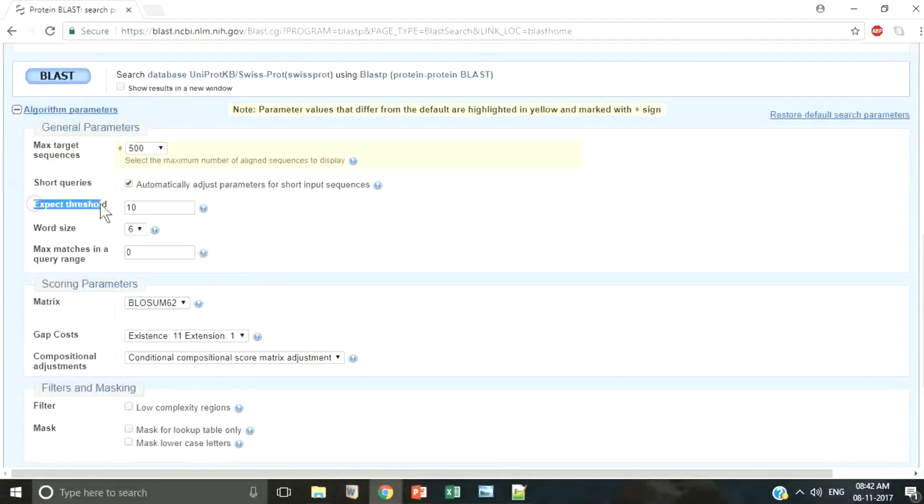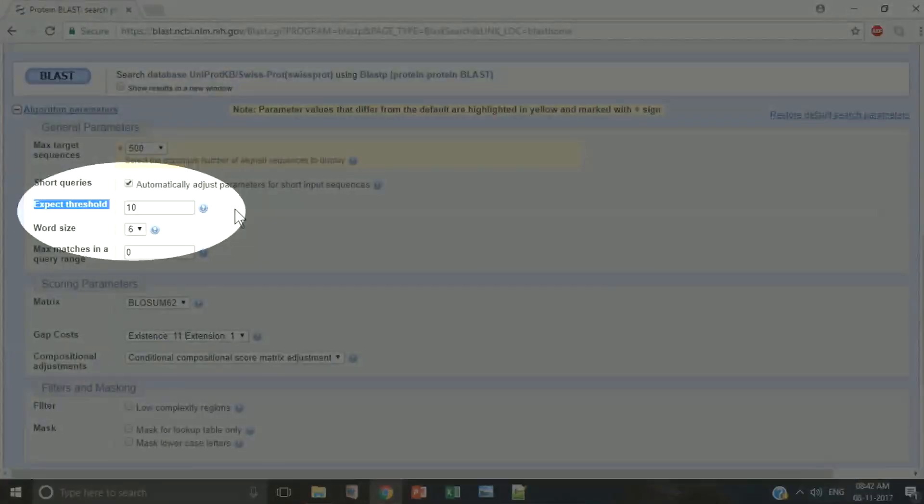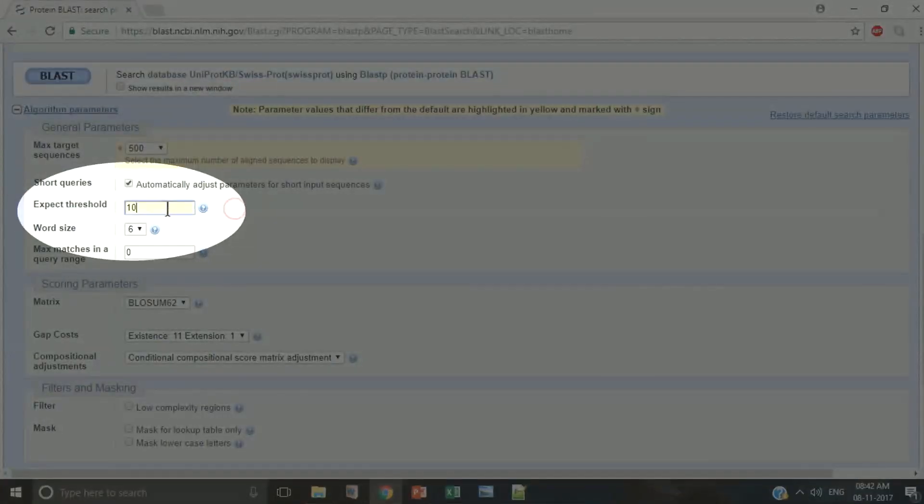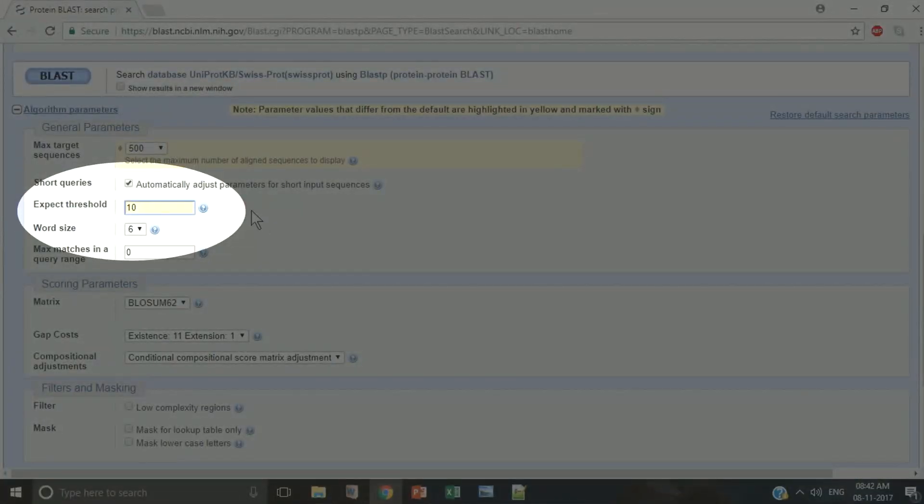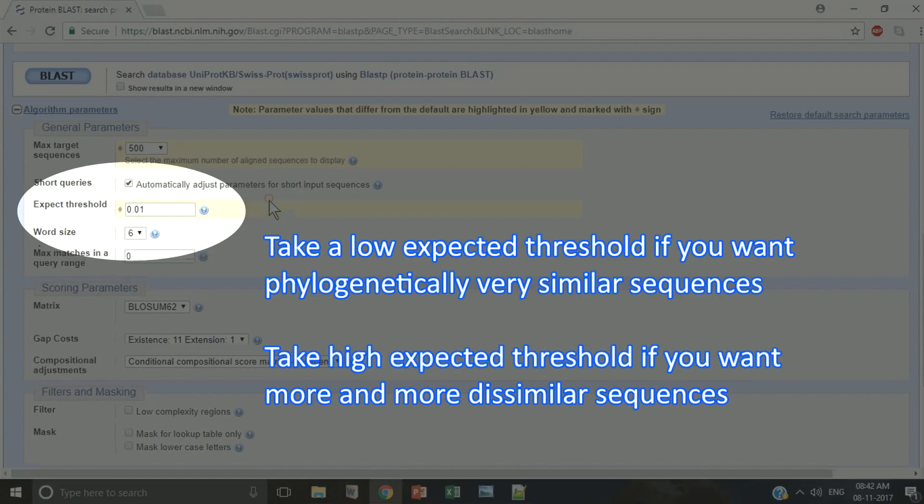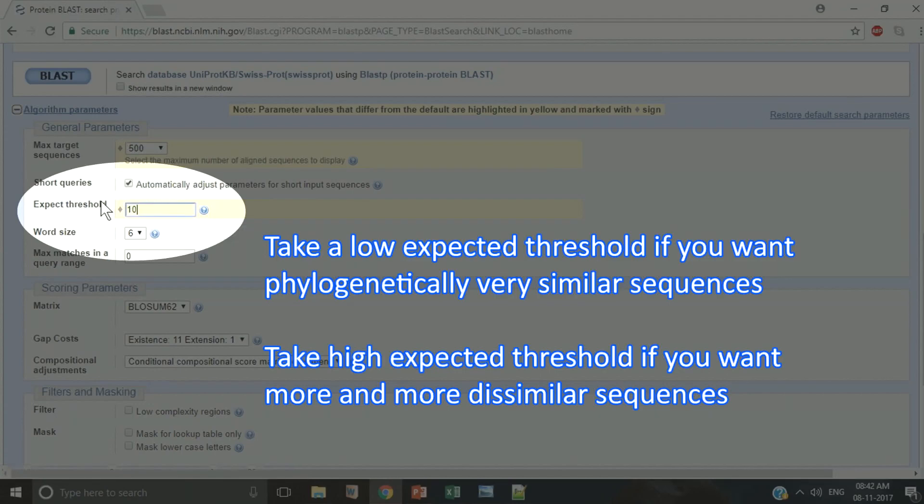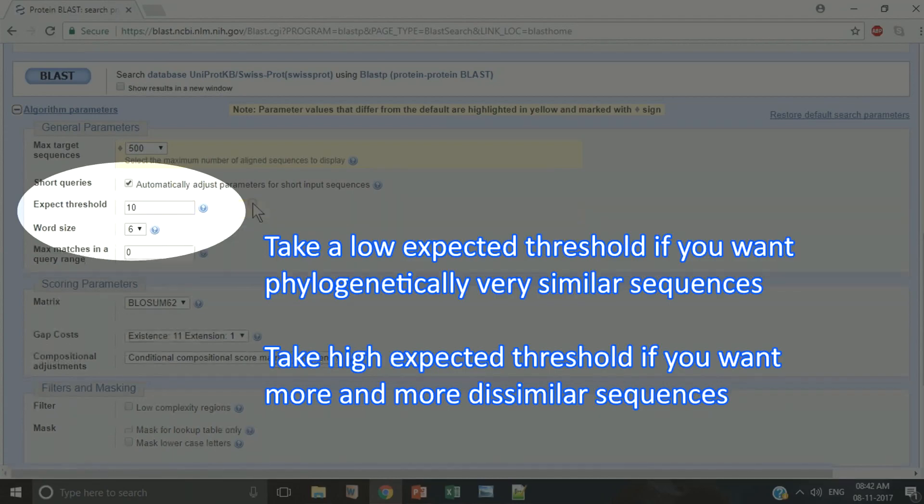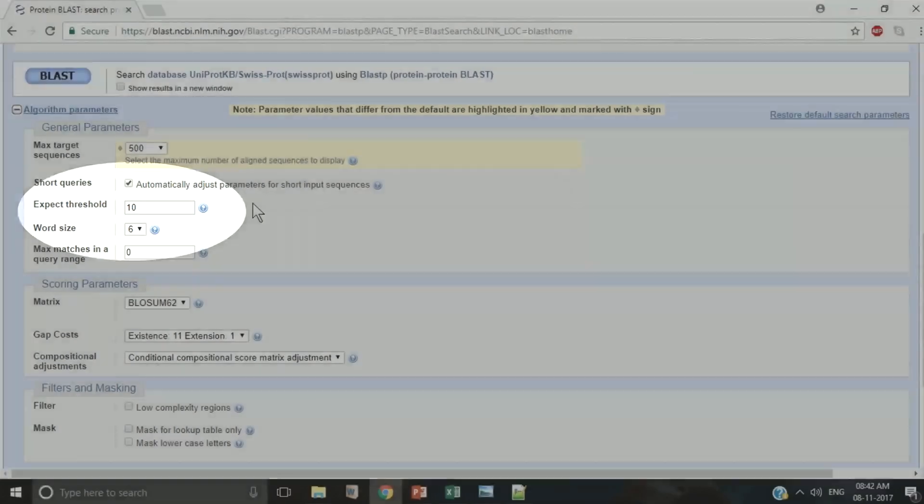BLAST offers you to choose this expected probability threshold during each BLAST run. Take a low expected threshold if you want phylogenetically very similar sequences. Take a high expected threshold if you want more and more dissimilar sequences. Choose it according to your aim.